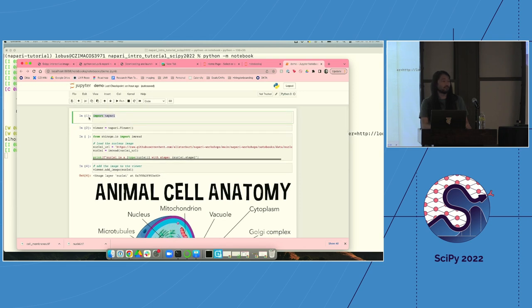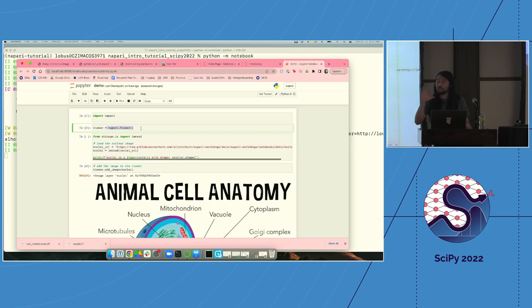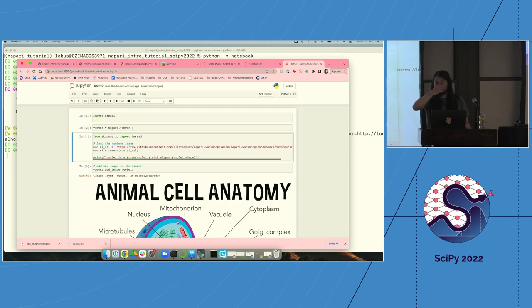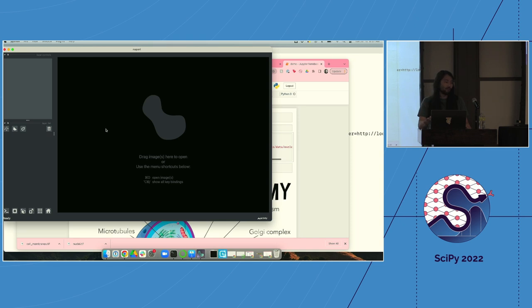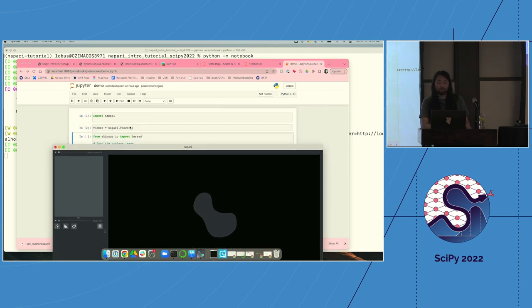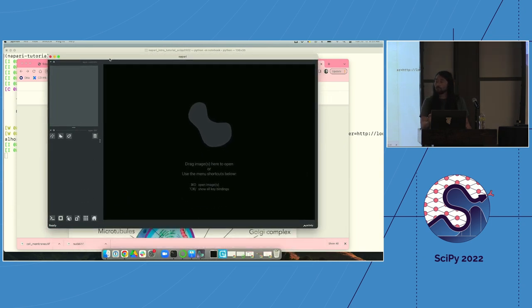In Python, when you want to use a module or library, you have to import it — so we say `import napari`. Then `napari.Viewer()` launches the viewer, the actual graphical user interface, and returns a viewer object, which is your Python representation of the viewer. This is how you interact via script or command line with the viewer you see. The first time you launch Napari it takes a bit more time — that's normal, just be patient.